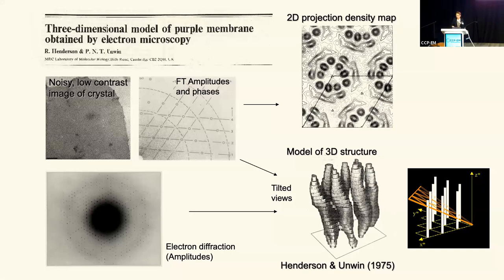You had like 25 or 50 films on a cassette. There were all sorts of vacuum pumps involved because the films would be all wet and you couldn't put them in the column of the microscope without making a mess. So this was pretty inconvenient. But that's what we had. We didn't realize there was anything better at that time.